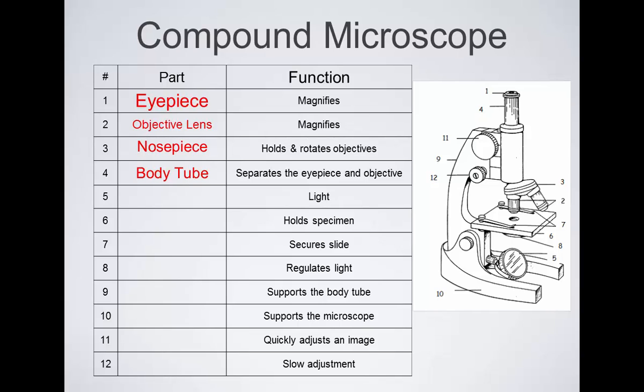Now the microscope in the drawing down here, it looks different from our microscopes. What does this look like here? That's a mirror. Older microscopes often had a mirror down here. And what you would do is you'd have a separate light that you plug in. You aim the light at the mirror. The light bounces off and then goes through this microscope. Newer microscopes don't have a mirror there. They just have a light that shines directly up through the stage. So that's the light source that's here. In this one, it's a mirror. In ours, it's an actual LED light.